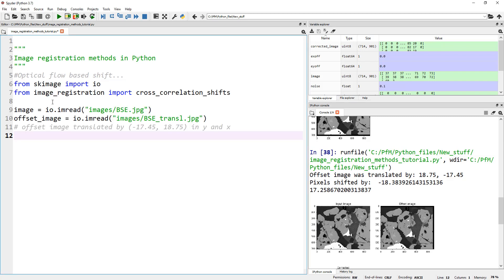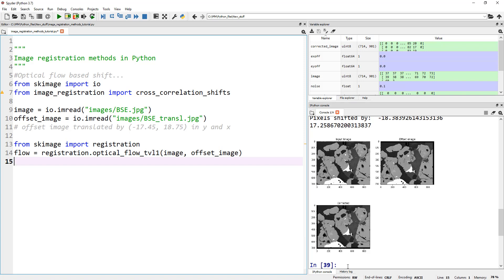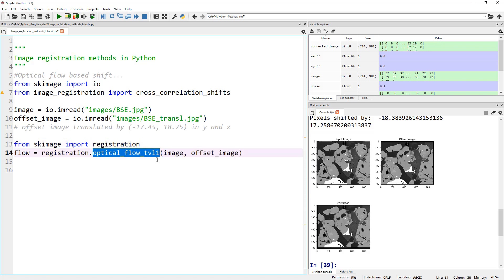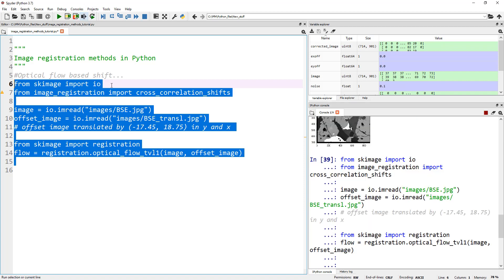How do we do that optical flow based shift? The first few lines of reading the image are the same. Let's read both offset_image and the original image. Within scikit-image, if you don't see this optical_flow_tvl1 in your scikit-image, go ahead and update your scikit-image. Do a quick Google search on how to update scikit-image on your Anaconda. Within scikit-image, import registration, and as part of registration, optical_flow_tvl1 is one of these functions. Here you provide your image and your offset_image. Let's run it until this point. This may be slow because it's calculating the vector field at every pixel.